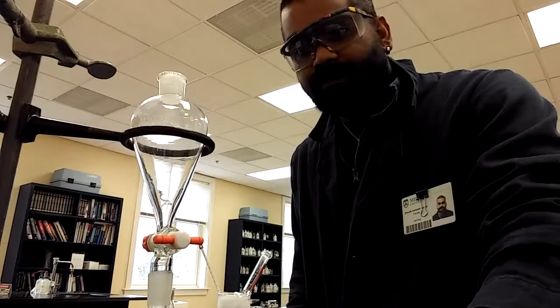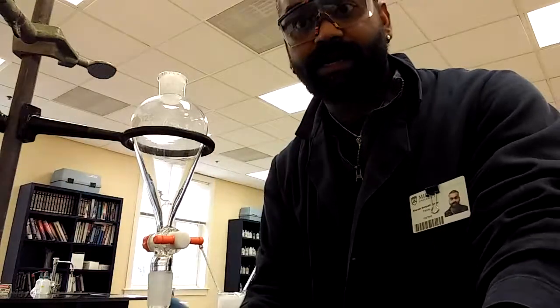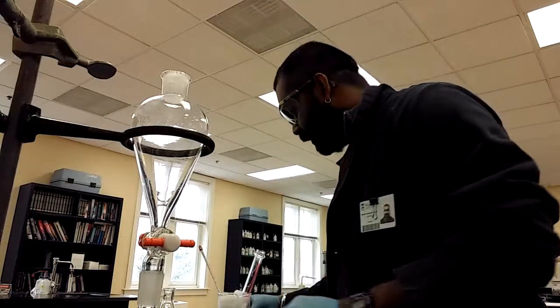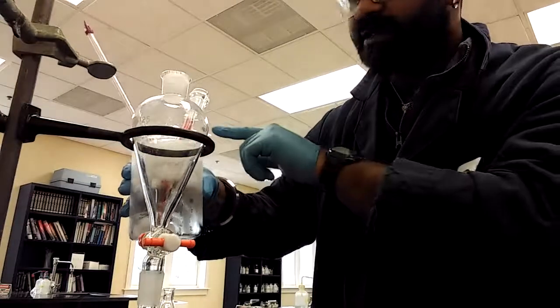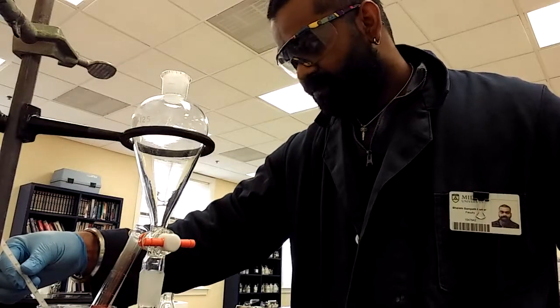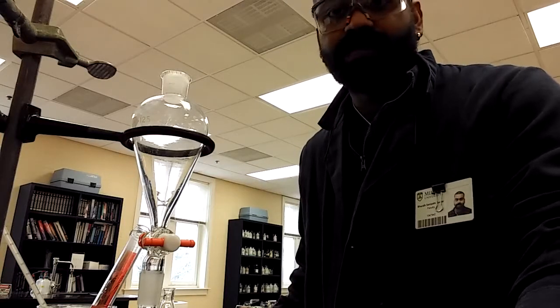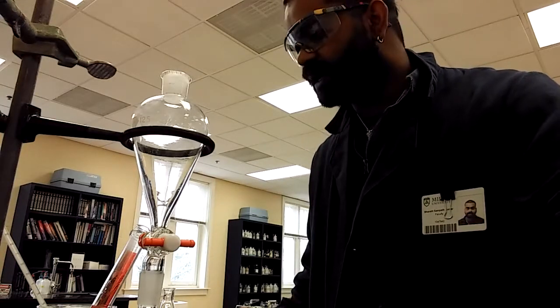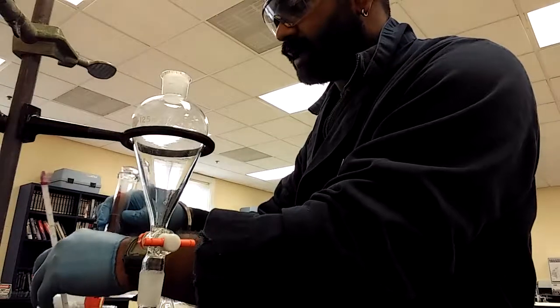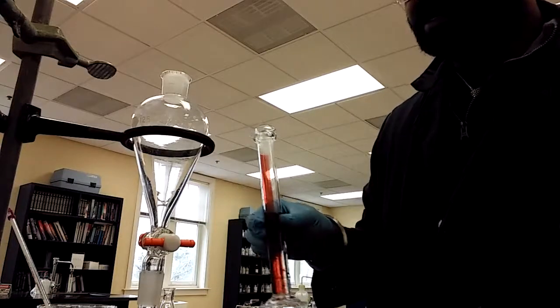Alright, I'm back with the first step in the procedure, which is I got an O-ring attached to an iron stand, and then I put the separatory funnel here. I got my stopper with me. So here is my 35 milliliters of hydrochloric acid that's been sitting in the ice bath. Currently it's at 4 degrees, and the procedure calls for 5 degrees. So as I said, if you're plus or minus 1 or 2 degrees, it doesn't have to be that accurate. The goal here is we're trying to keep the hydrochloric acid cold because we will be adding the alcohol into it, and the reaction could get a little haywire.